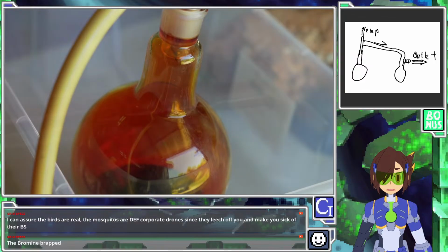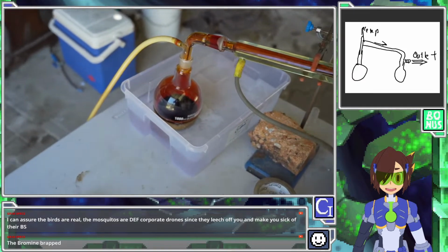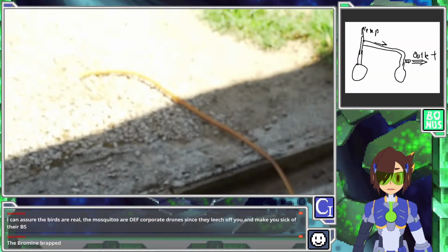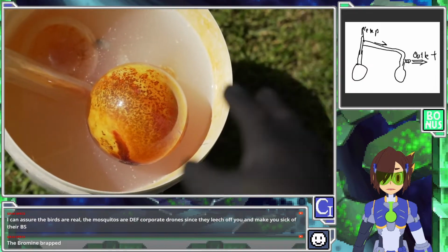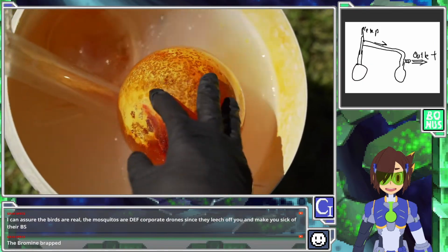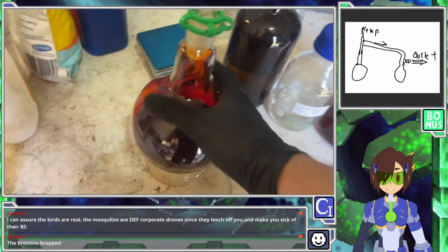But there he goes. Oh yeah, I mean, he's doing the smart thing and not just, I can't believe it, not just putting more bromine fumes out into the world. Why he cares so much now after not having... oh no, he's just putting it further away from him. Never mind. I thought he was putting it in a scrubber to reduce down the bromine, and afterwards in that bucket to neutralize it. But no, he just put the bucket further away from him.